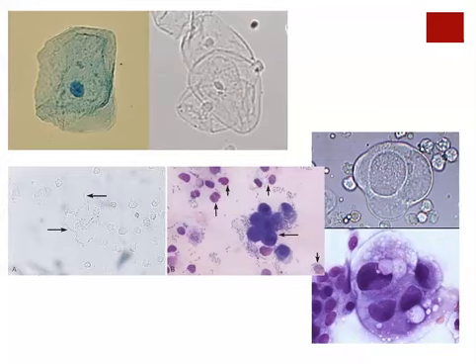On this slide, we're looking at some images that were taken under a light microscope. Let's start in the upper left-hand side of the slide. You're looking at two identical types of cells in these two images. These are epithelial cells. These are eukaryotic cells. We can see that because of this structure right in the middle. This is a nucleus.